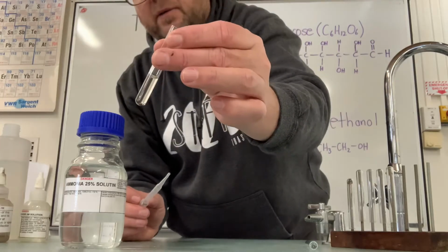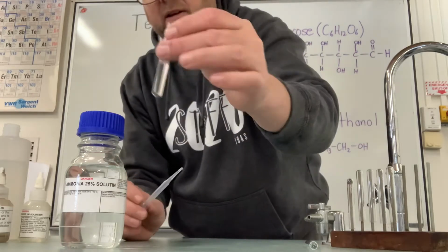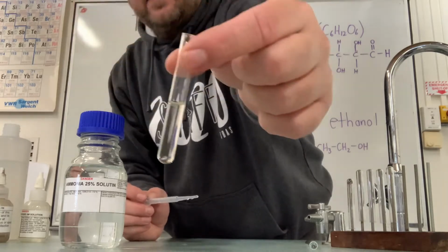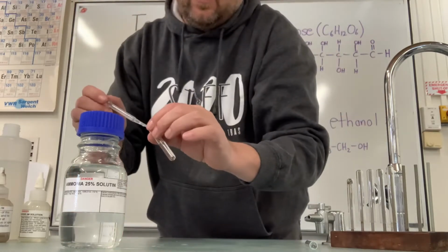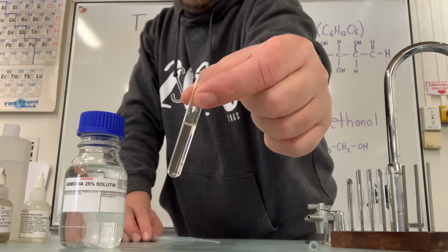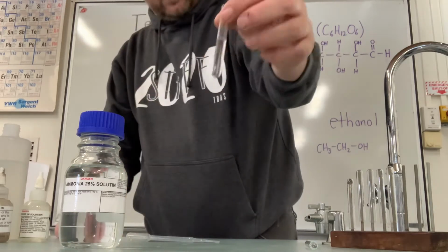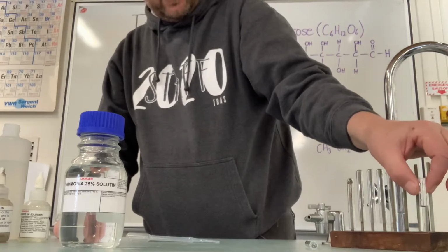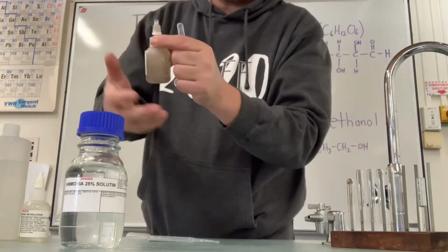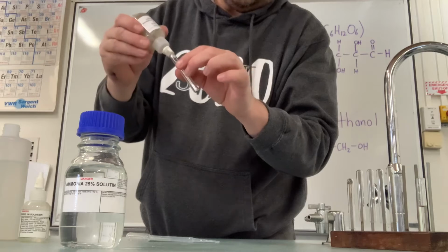And you can see that brown is disappearing, hasn't quite gone yet. So we just add a little bit more. And now all of that brown precipitate has just about dissolved. I'll just add that last bit. So we have made an ammoniacal silver nitrate solution. Now, I'm just going to put that to one side for the moment, and we will quickly make up another one, because we want to compare here an aldehyde with an alcohol.